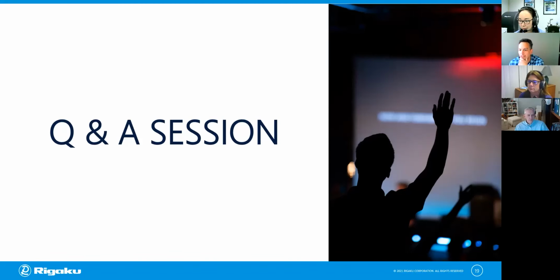Mike wants to answer Alexander's question, it appears. So is there a quick and easy way to remove the background? If you're just looking at pores, the background is not included in the thresholding. Right, so it depends on your sample. There could be different particulars in how to answer your question. But if you have a sample that has internal pores that you want to characterize, and then there's also surrounding air, and you want to measure just the pores on the inside, but not the air on the outside, and if your pores are closed off and they don't connect to the surface, then it's a simple problem.